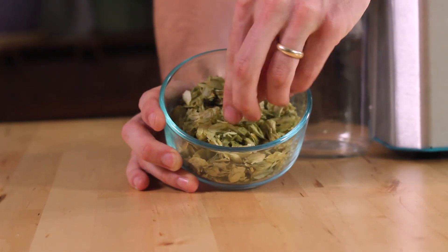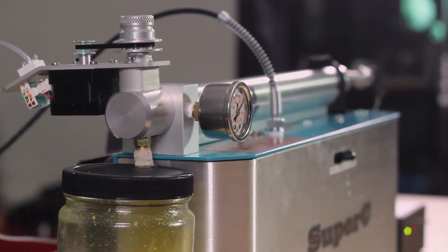Yields are material dependent and can vary from 15 to 18 percent for a material like hops, or be as low as 0.5 percent if running something like rose petals.